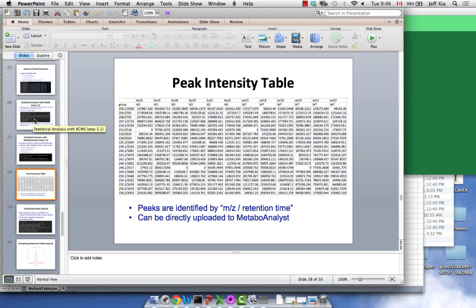There are zeros in there, given the rest of the columns. Would you be concerned about the zeros, or would you think those are just missing? We can visualize a peak. That's what we are going to discuss. Some of them really have no peaks there, and we are confident it's zero.